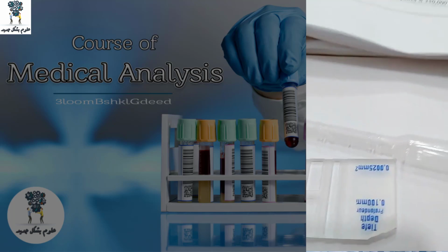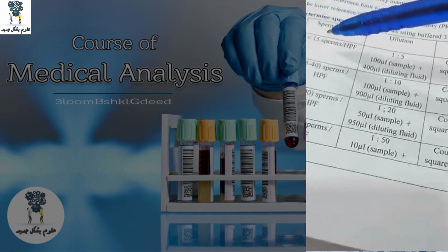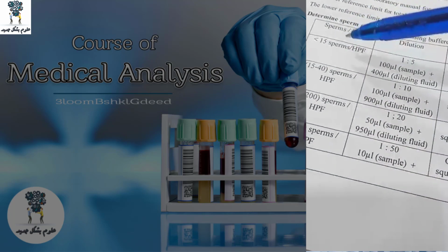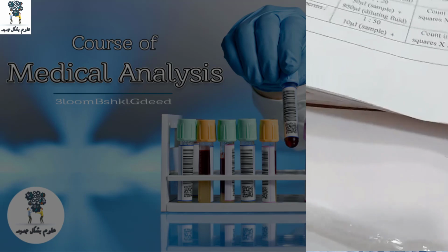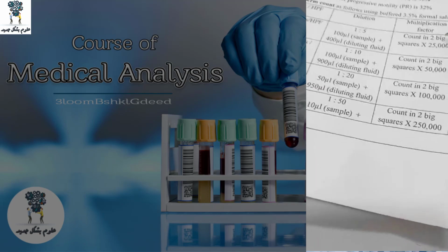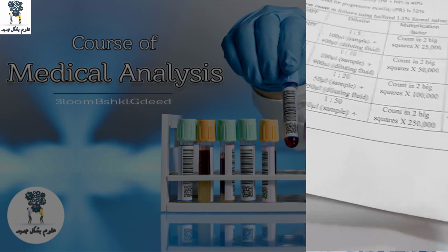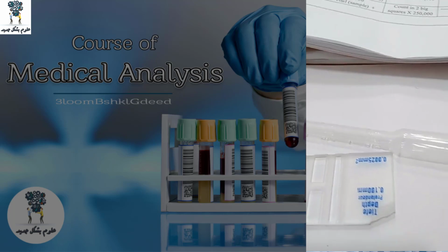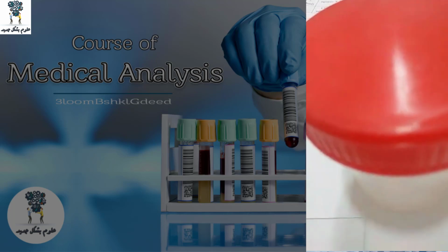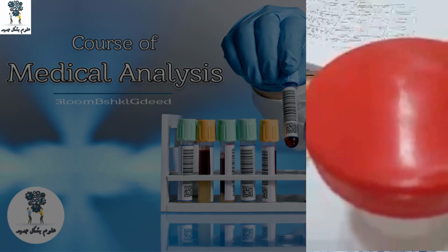So you will treat it as the first case, that it is less than 15 sperm, and make the normal dilution, and then multiply by the factor 25,000. So it is very important to identify your case from the first, and there are steps for everyone.